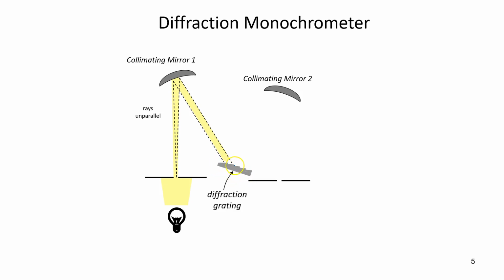You can see all these different grooves. Sometimes those grooves are called blazes or a blaze, and at every groove, diffraction occurs. Here you can see it happening. Notice how we've gone from white light to separated radiation, and actually diffraction occurs at every single blaze. I'm only showing it in two places just to make the diagram simple. So we've got our radiation separated into the different wavelengths.